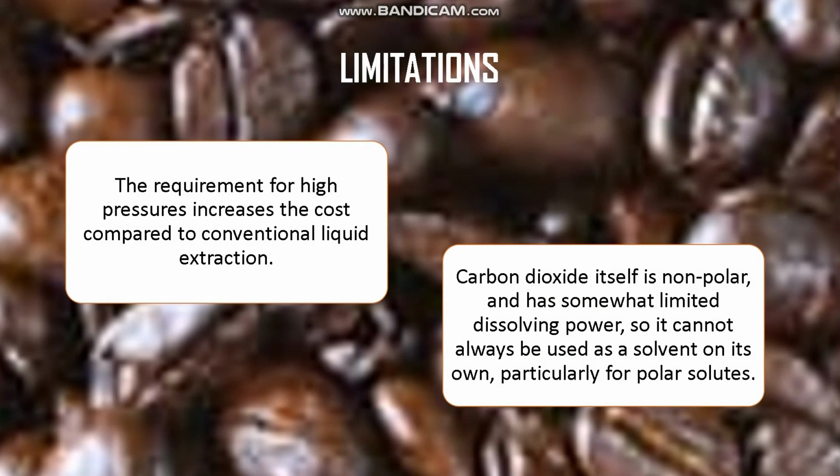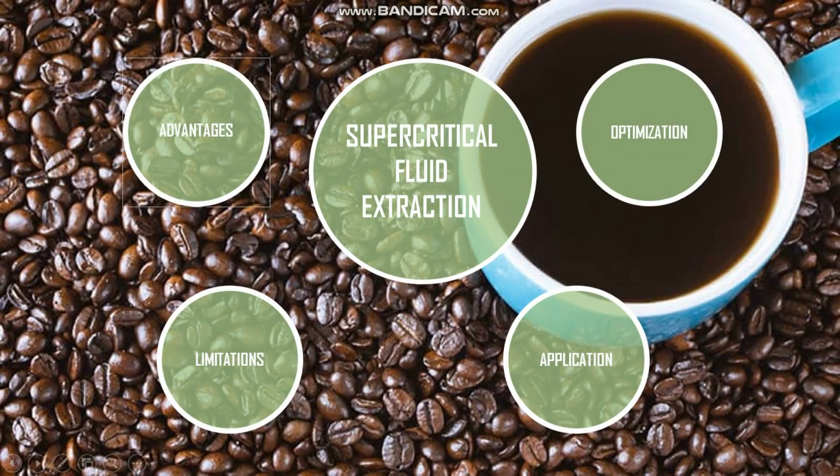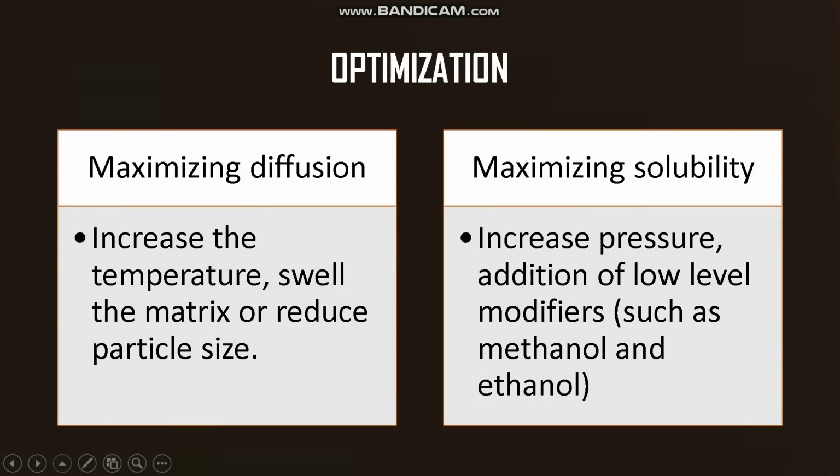However, SFE is very expensive because it requires high pressure to operate, and carbon dioxide has limited dissolving power. Next is optimization. To maximize diffusion, we can increase the temperature, swell the matrix, or reduce particle size. Next, to maximize solubility, we can increase pressure and add low-level modifiers.